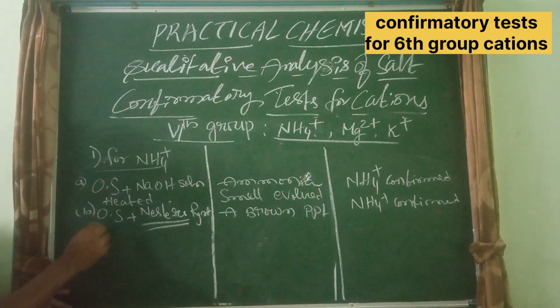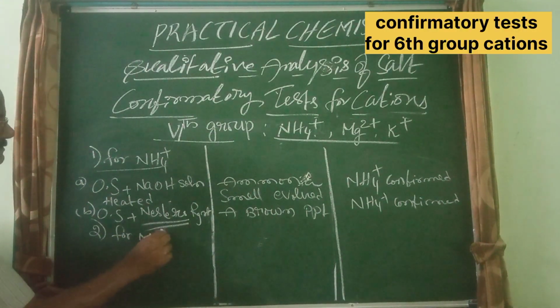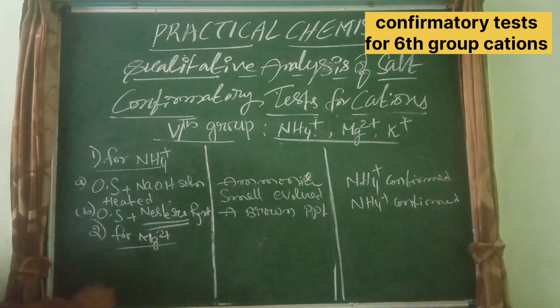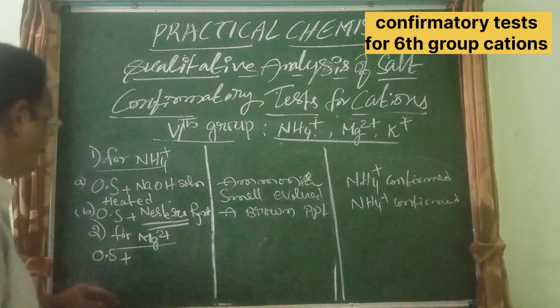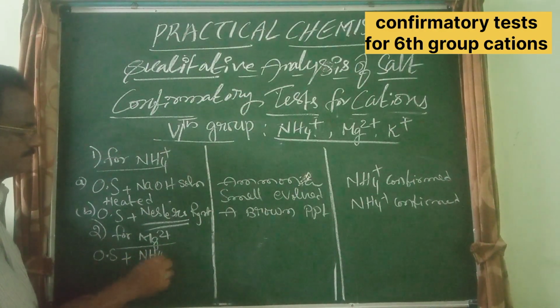Number 2, for Mg2+. This is also a simple test. The original solution is added with NH4OH.